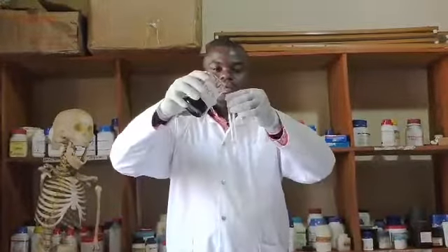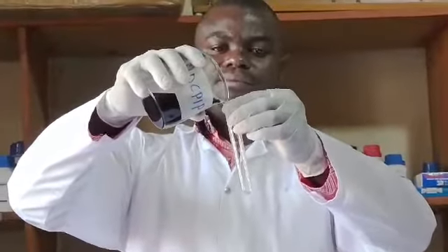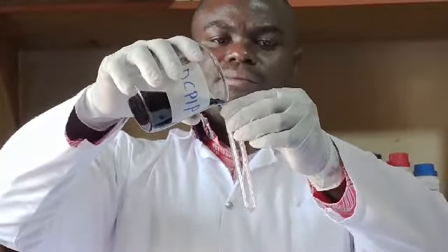I'm going to repeat the same using solution Y. I get my DCPIP and then pour one cubic centimeter. Again, take note of the original color and state of what is in the test tube. First, it is a blue solution.